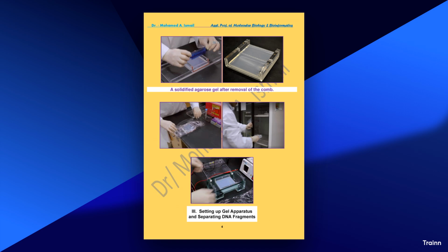5. Errors in data analysis. A. Misinterpretation of bands. Error: incorrectly analyzing band patterns, such as mistaking primer dimers for target products. Impact: this can lead to false conclusions about PCR success or specificity. Solution: compare band sizes to a standard DNA ladder and consider running controls for accurate interpretation.